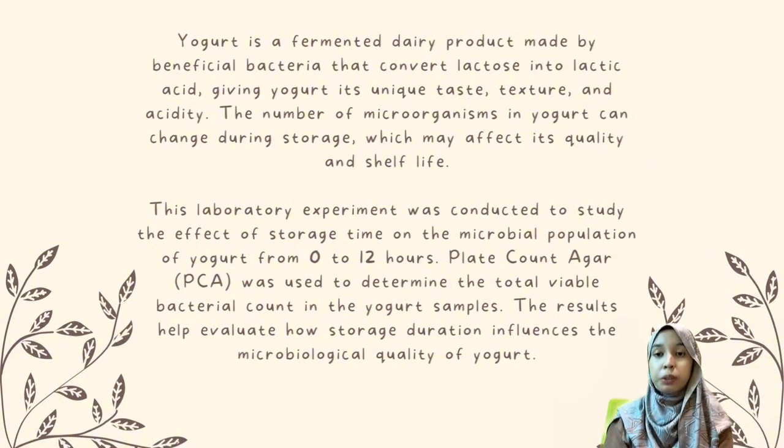Plate count agar or PCA was used to determine the total viable bacteria count in the yogurt samples. The results help evaluate how storage duration influences the microbiological quality of yogurt.